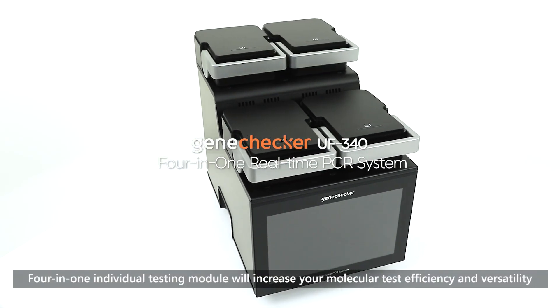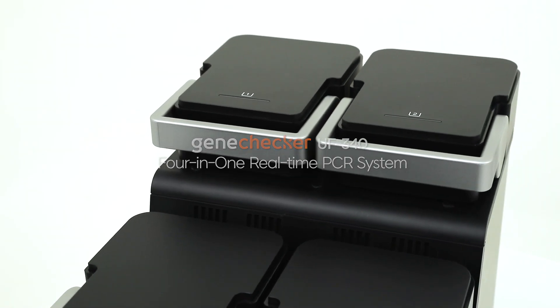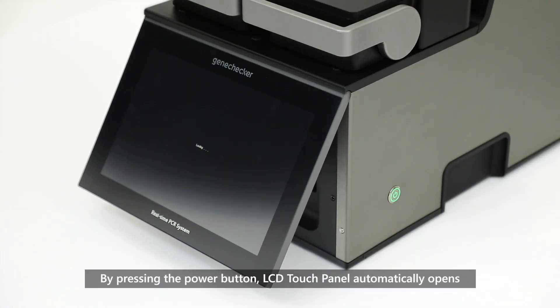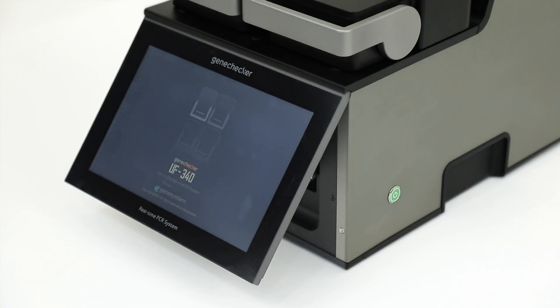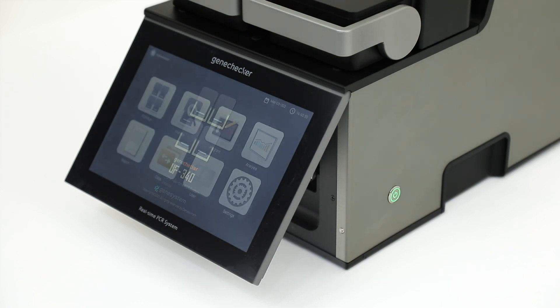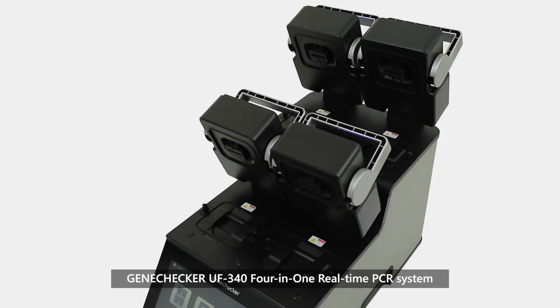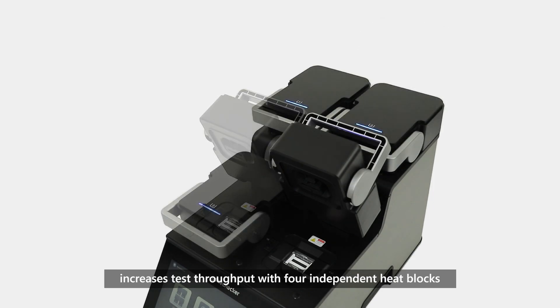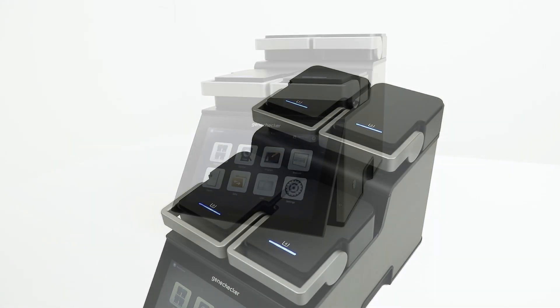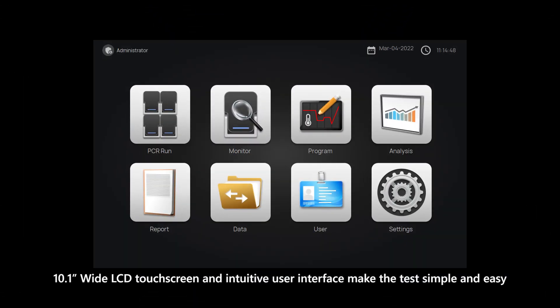The 4-in-1 individual testing module will increase your molecular test efficiency and versatility. By pressing the power button, the LCD touch panel automatically opens. The GeneChecker UF340 4-in-1 real-time PCR system increases test throughput with four independent heat blocks. The 10.1-inch wide LCD touchscreen and intuitive user interface make the test simple and easy.